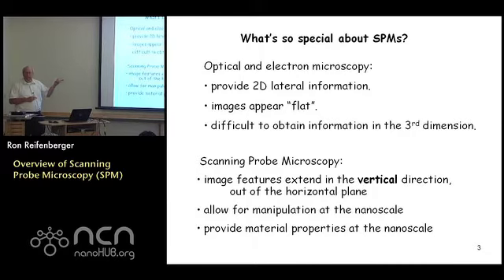In addition, people who use scanning probe microscopes have learned how to use them to manipulate, to actually move things around at the nanometer length scale. So this is not going to be a technique that's useful for manufacturing capability because it's very slow. But on the other hand, you can learn an awful lot if you have a small nanoparticle and you want to move that nanoparticle from point A to point B.